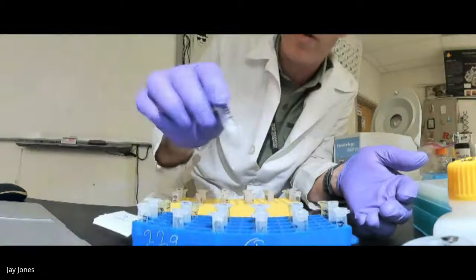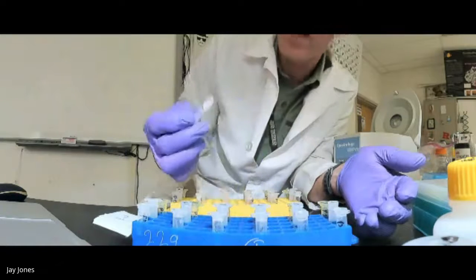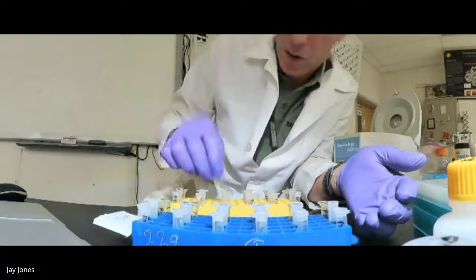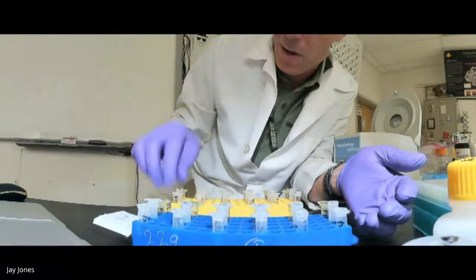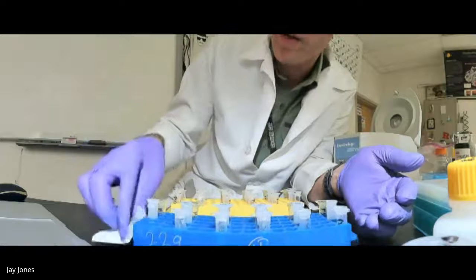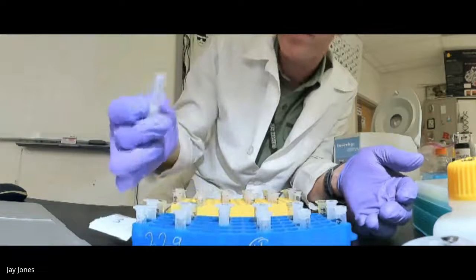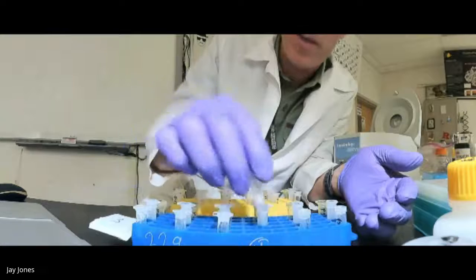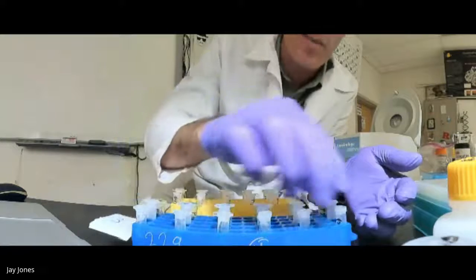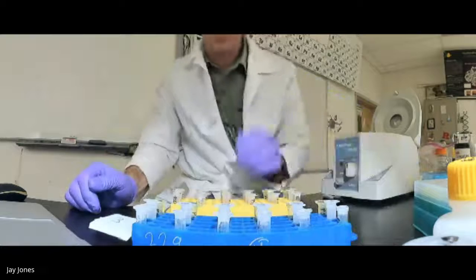Okay, so I'm just making sure that the acid got to all the soap, because I want the acid to get to the soap because I don't want the soap to work. The soap is still working. We got a problem. And the soap doesn't seem to be working at all. And that's what we want. We want precipitates. So now we're going to spin these to get the precipitates away from the DNA, the supernatant.